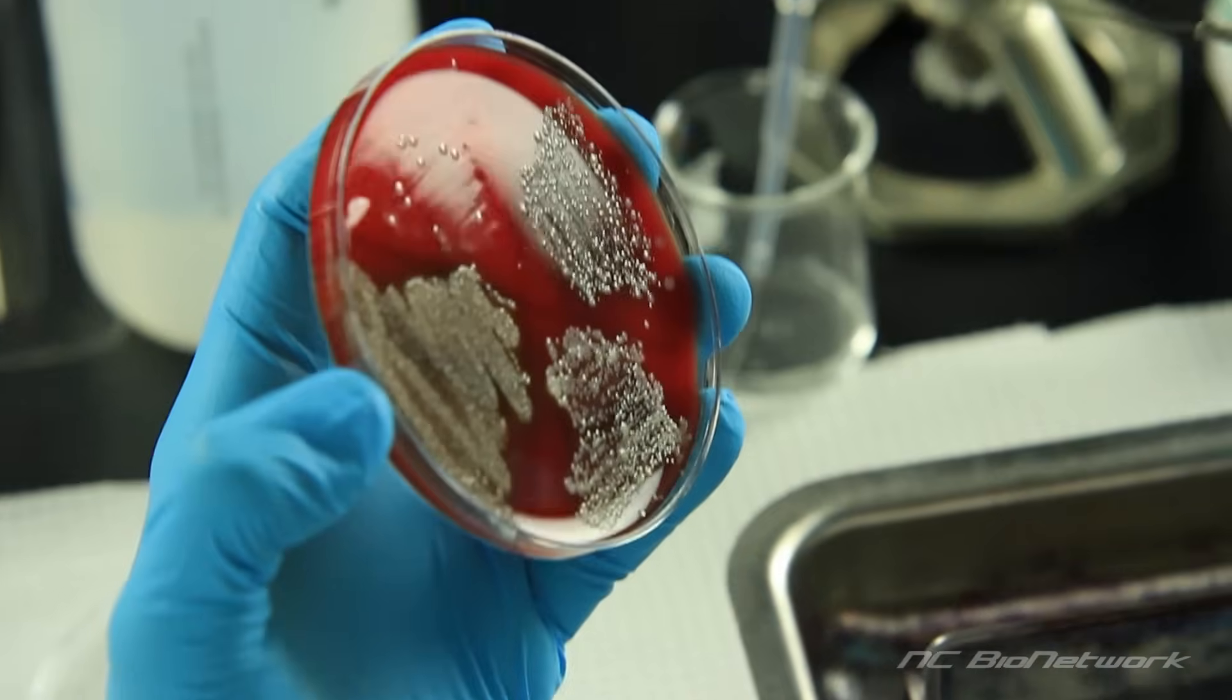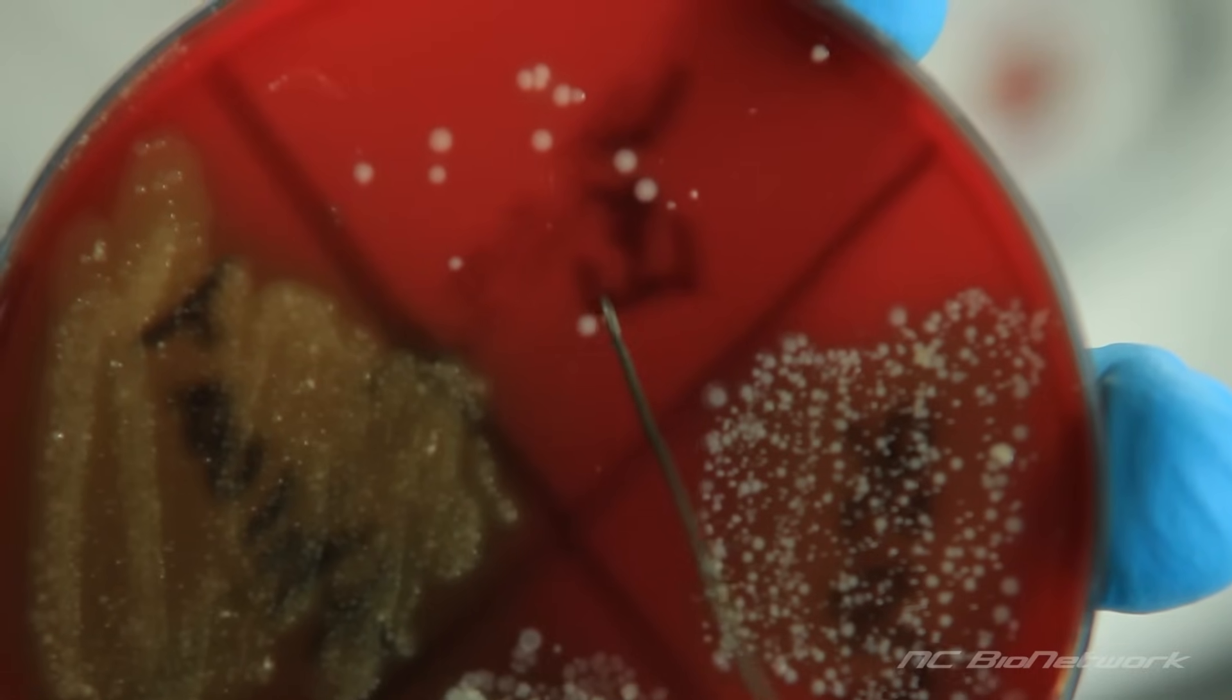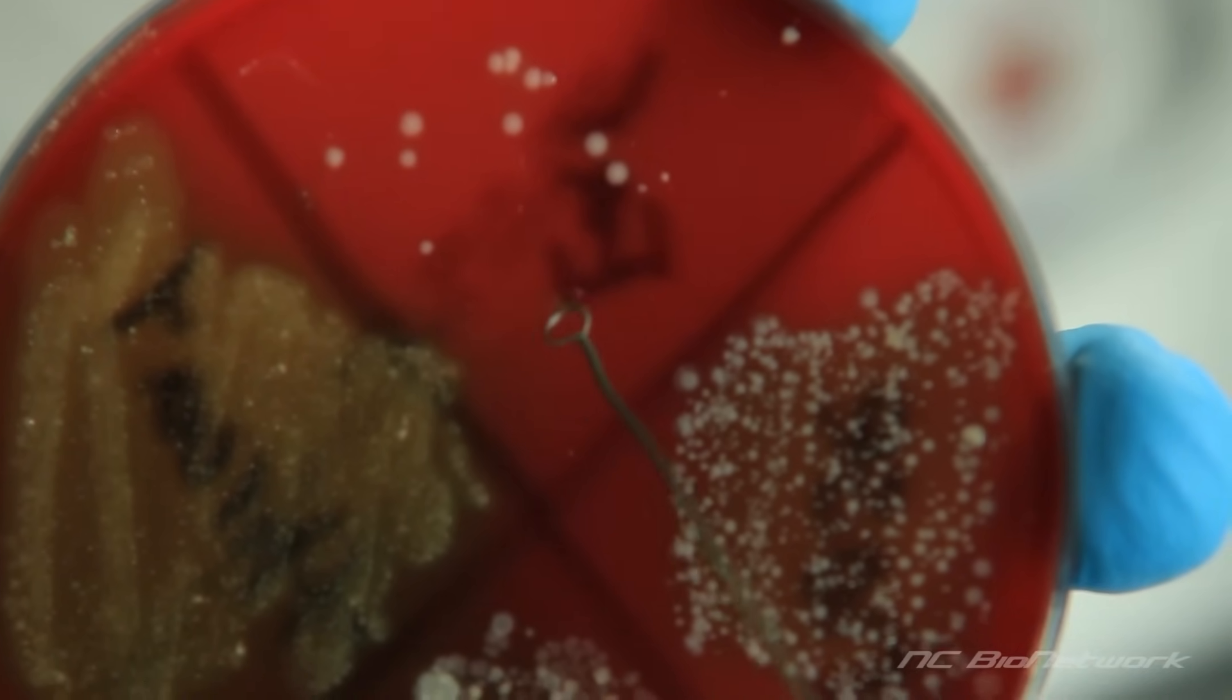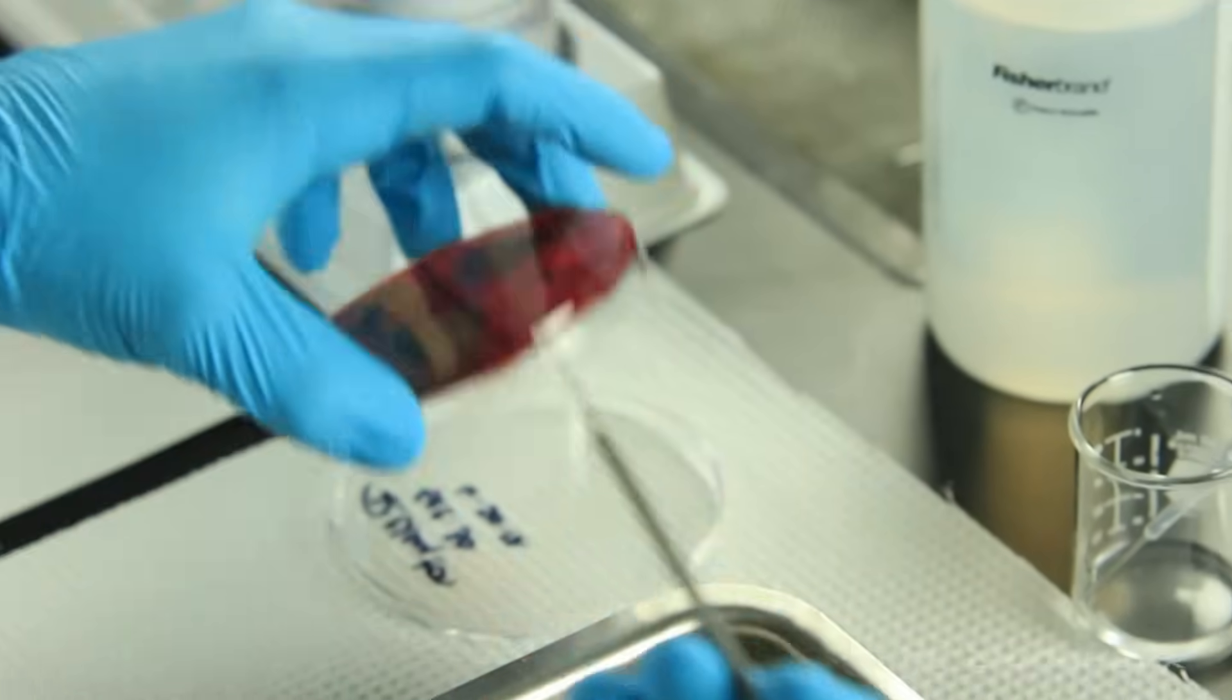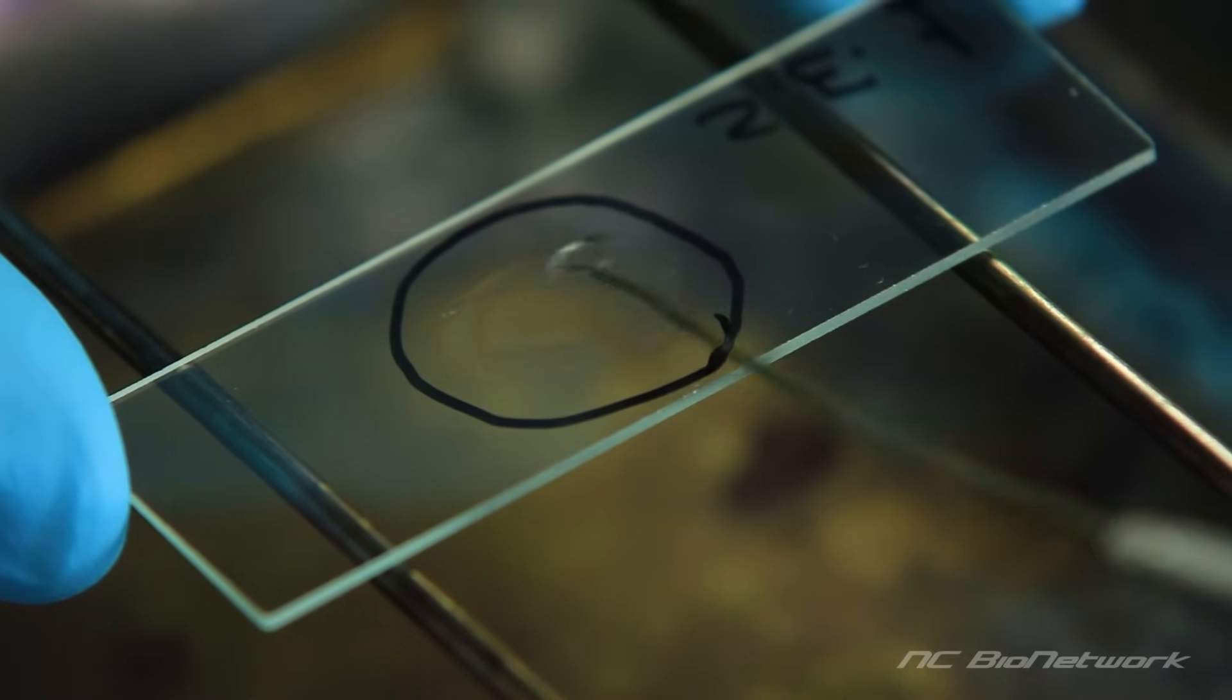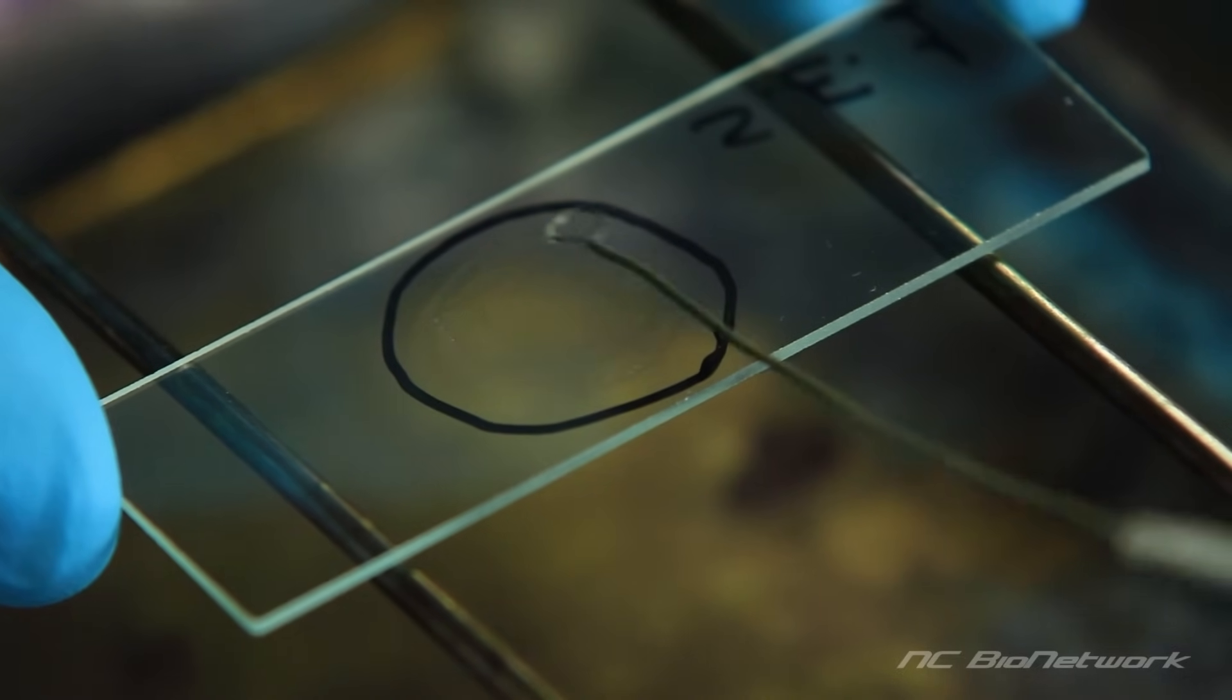touch the bacterial colony and transfer the bacteria to the slide. Use the loop to mix the cells and the water. Spread the mixture to completely fill the circle.